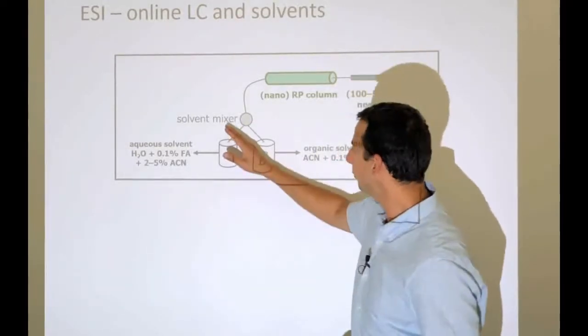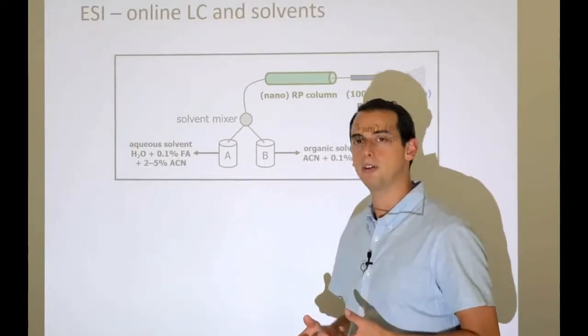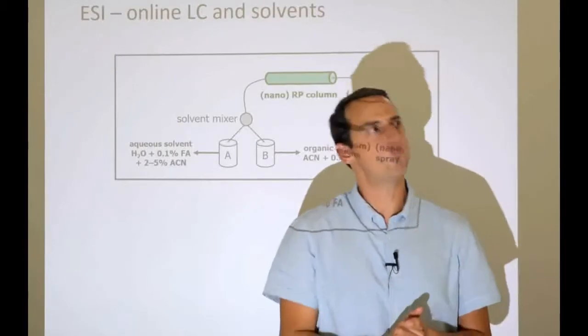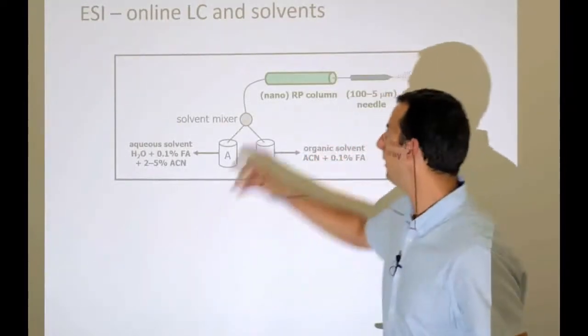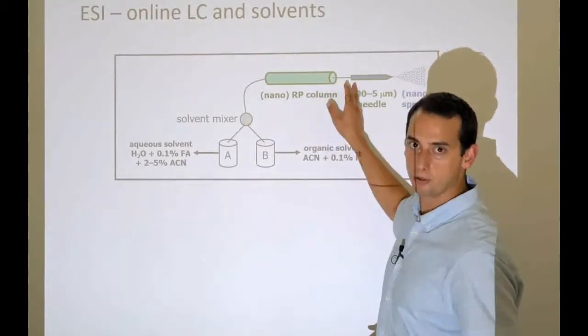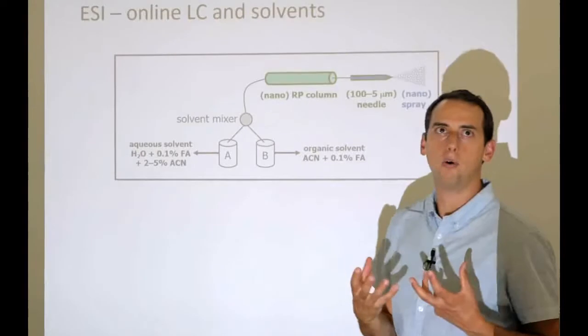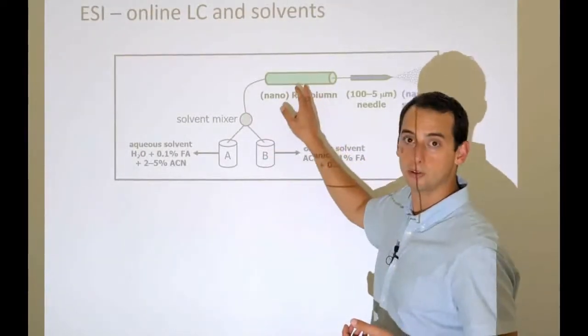But then over time, we're going to have more and more of this hydrophobic mixture, solvent coming through the column. And then another set of peptides might say, this is more to my liking. They will let go. And so you see we get a staged release of the column depending on the amount of oiliness, on the hydrophobicity of the solvent that we wash over the column.